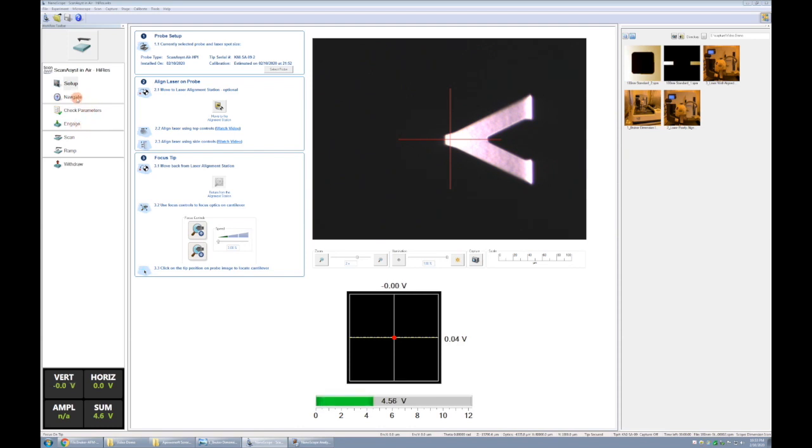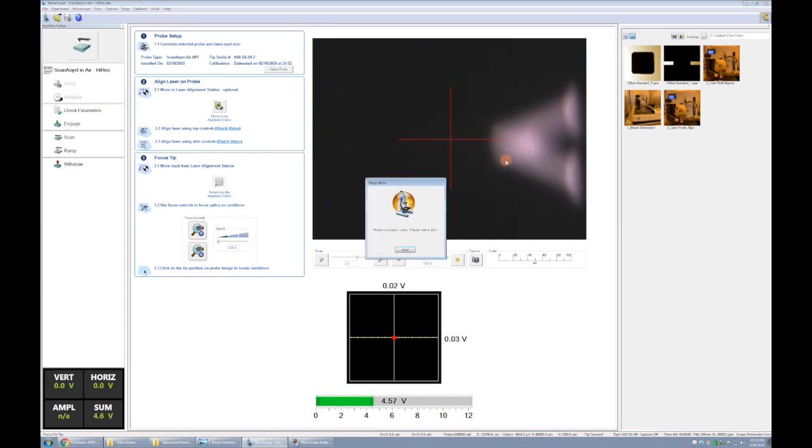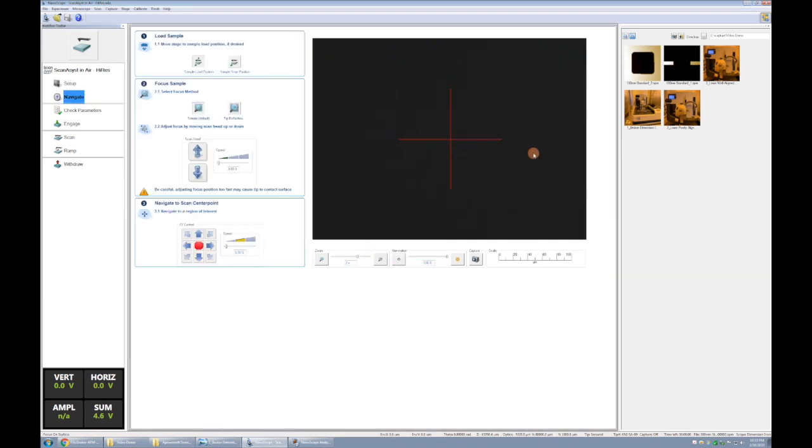So first we're going to click navigate. That will change the objective lens focus so that it's focused on a plane that's one millimeter below the cantilever. Now it's our job to get the scanner one millimeter above your sample, and that will happen when your sample is in focus.